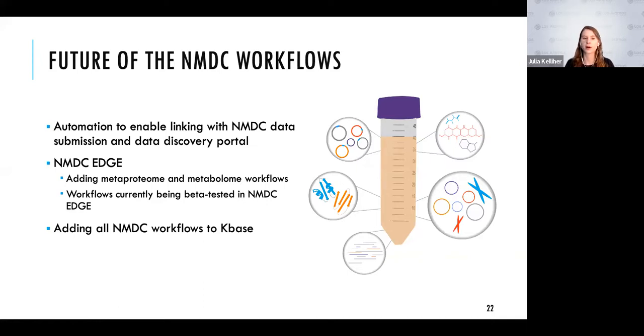There's also a question mark of what is the future that you all want to see for the NMDC workflows? Are there different changes that you would want to see? Are there different tools that you would want to incorporate? Are there different ways of visualizing the results? Are there different tables you'd like to see in NMDC EDGE? Anything like that. The NMDC is really committed to this community-driven approach, so the future of the NMDC workflows is the future that you all want it to be. We have a lot of future plans, but we really want to incorporate as much of the user feedback as possible.